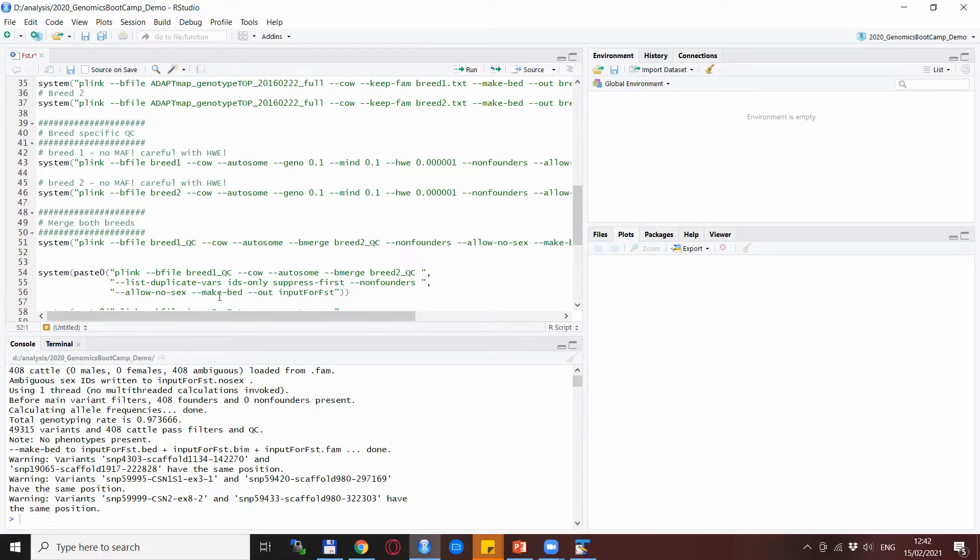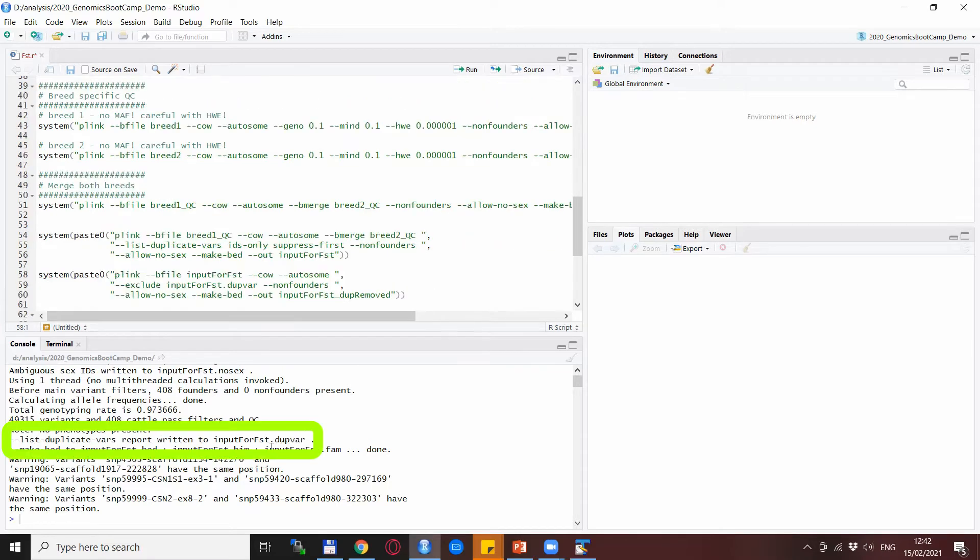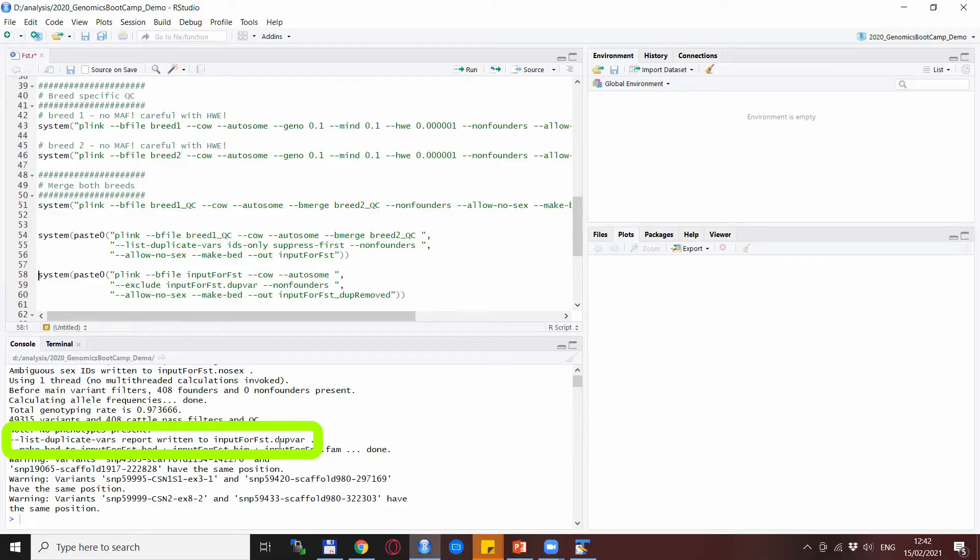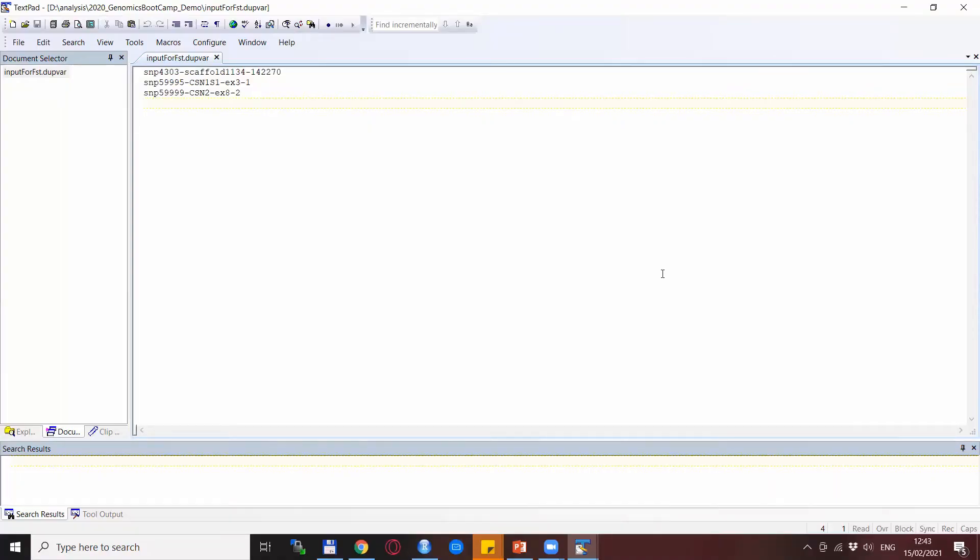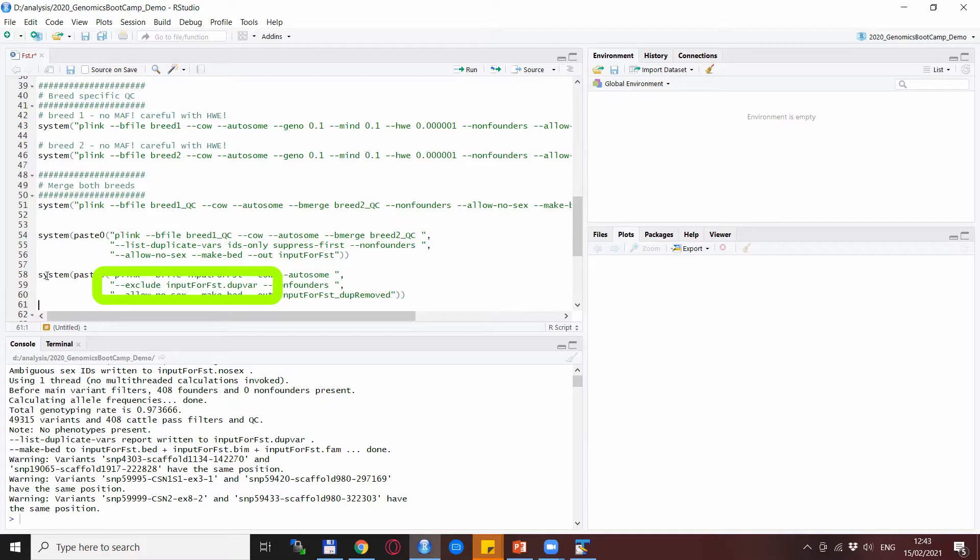What we do is actually use the capacities of Plink for this. With the --list-duplicate-vars we actually create an output file with the names of the duplicated SNPs. This is the list duplicate vars file, and the output name is also input for FST. So we run this and a file is created—you see here the list duplicate variables report written to input for FST. This is how it looks like. You see that one from each SNP pair is listed here, and we will use this list of SNPs with the --exclude statement to remove these from the data set.